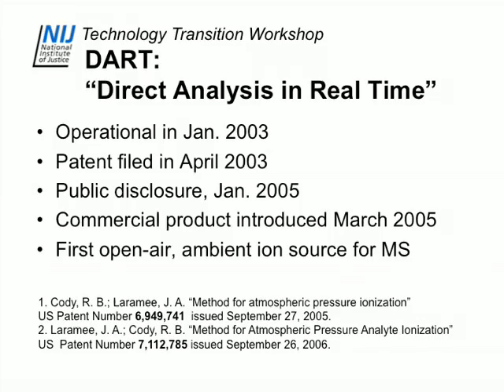And we first announced the DART at the Sanibel ASMS conference. I think it was in Clearwater, Florida that year, which was in January 2005. And that's where I first met Bob and heard him give a very entertaining talk. We published an article in Analytical Chemistry shortly thereafter and went to the Pittsburgh Conference of Analytical Chemistry and Applied Spectroscopy and had the commercial DART fully implemented, ready to go. So that was March 2005.